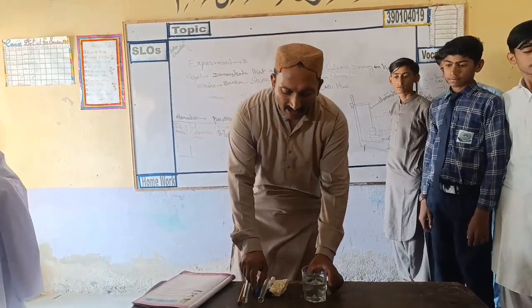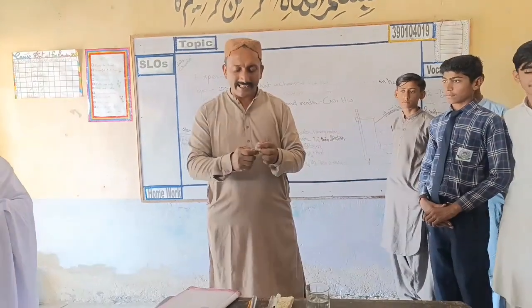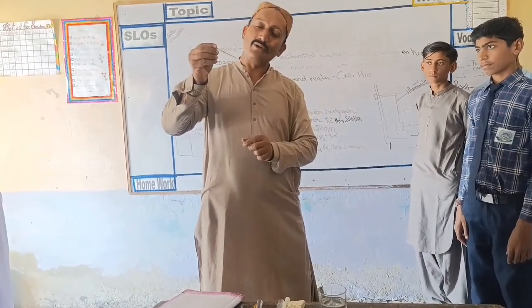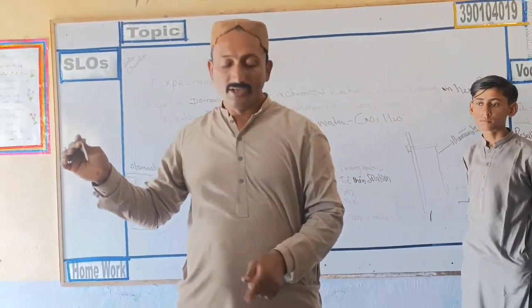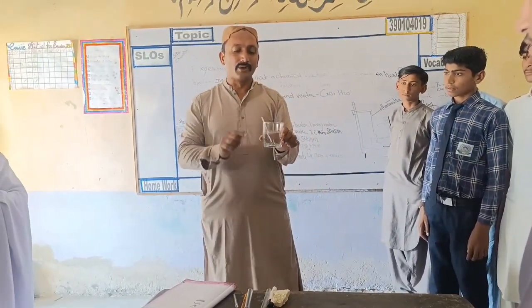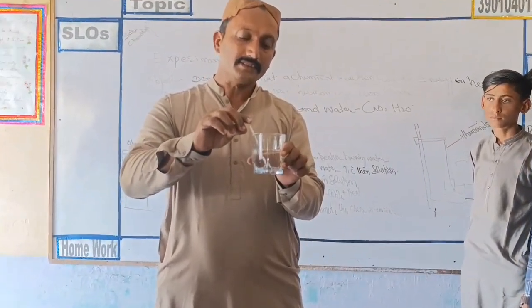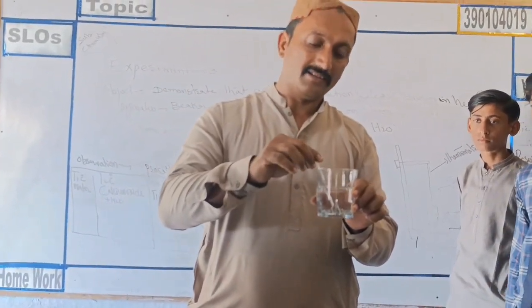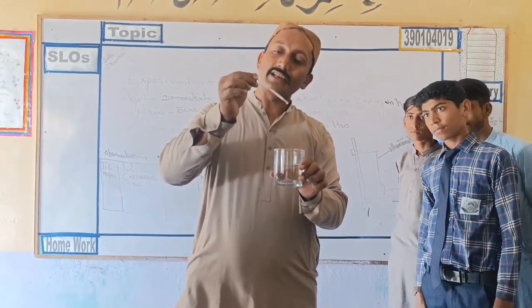First of all, take the water. For the initial temperature T1, the thermometer should be put at the 0 point, the thermometer requires 0. When dipped in water, it takes some minutes for the temperature of the water to rise. After that, the thermometer calculates the heat of the water, which is the rise of temperature.